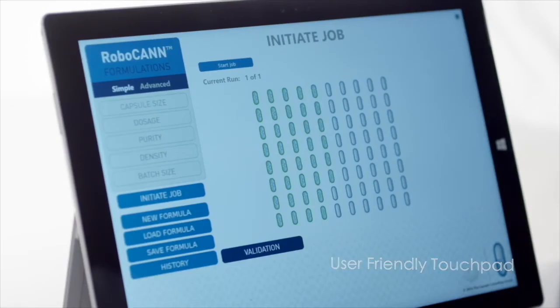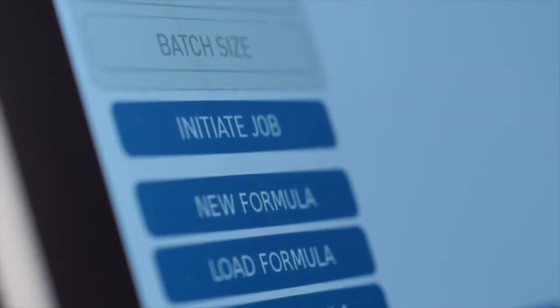Every Robo LQ model comes equipped with a user-friendly touchpad that drives our custom formulation design software.